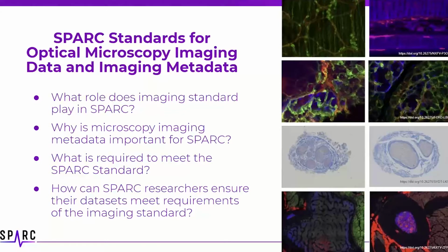MicroFile Plus writes this metadata to the header of the file, not a sidecar, and in accordance to the OME-TIFF specification. This tool makes it easy to produce image data that can be readily shared and disseminated, whether that's within your lab or to others in your department or to the public on a data portal such as the SPARC portal.